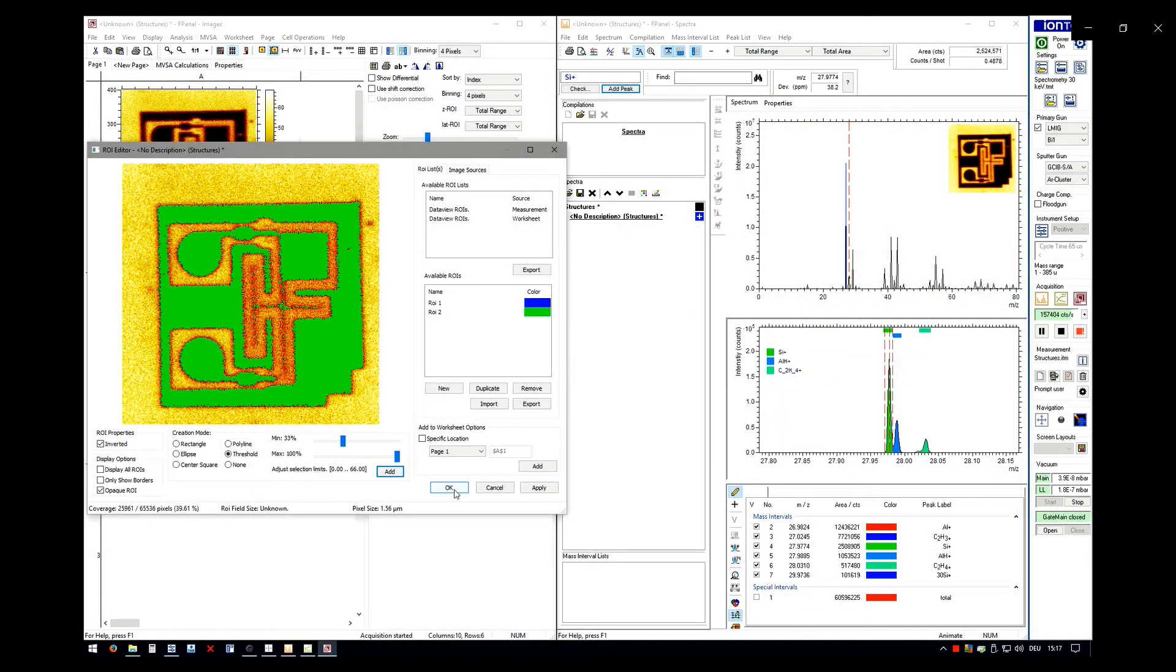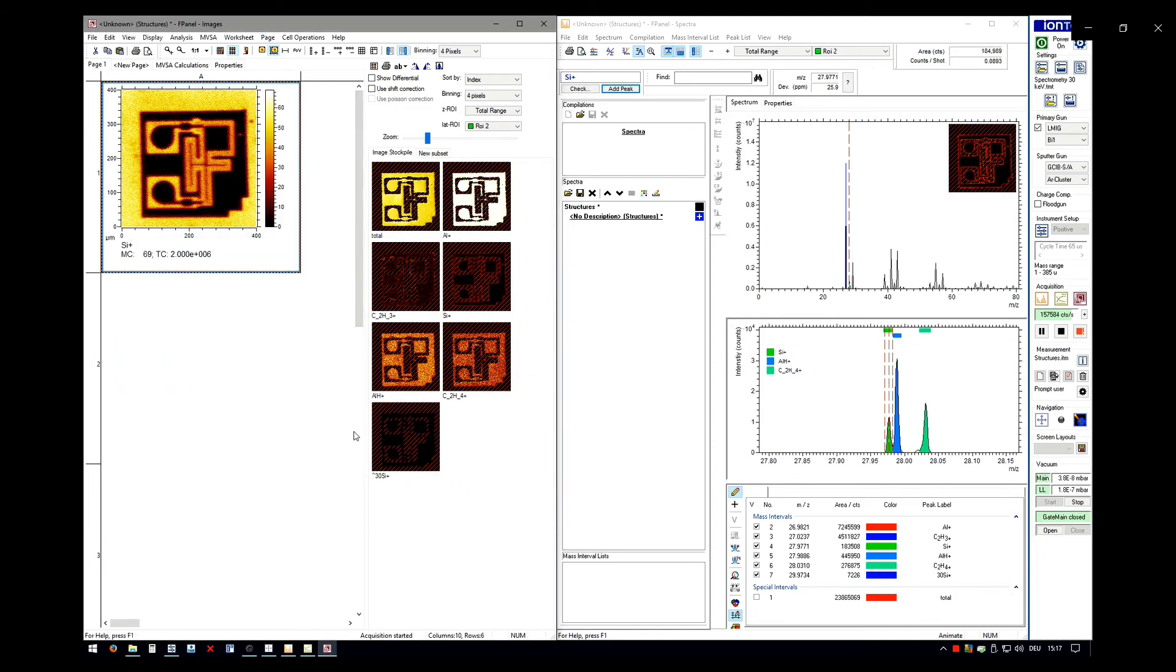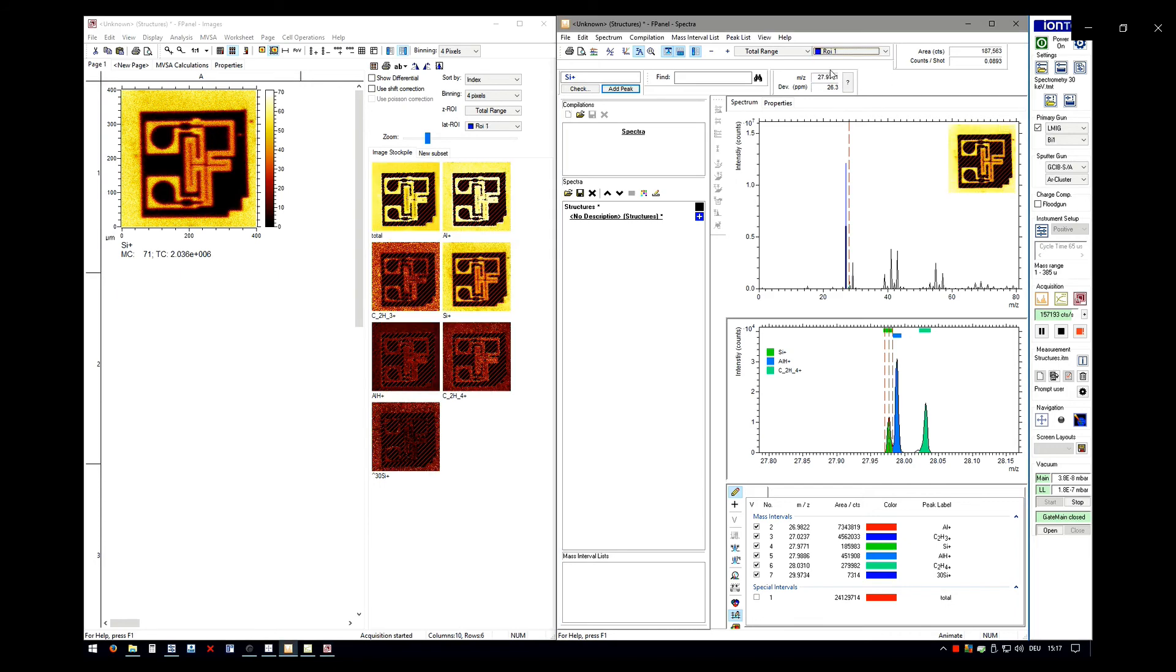Here's an example for regions of interest. If you limit your data view to a lateral ROI, the spectrum program will show immediately the corresponding spectrum without data reconstruction.